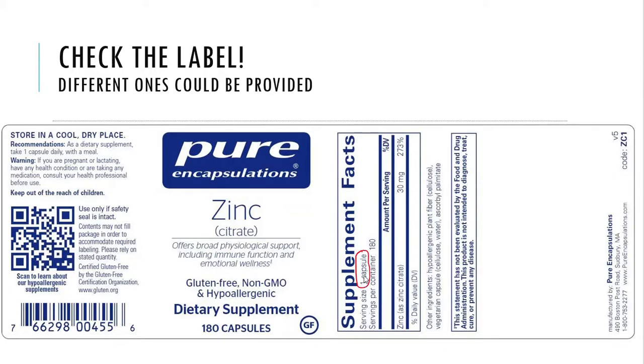In this case, it is. So one capsule, and it says zinc as zinc citrate. And this capsule is going to give me 30 milligrams of zinc, if this pill fully breaks apart and gets released and does what it's supposed to do. So one capsule releases 30 milligrams of zinc, and I'm going to test if this really does give me 30 milligrams of zinc or not.